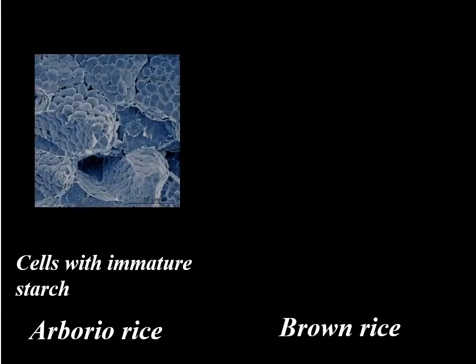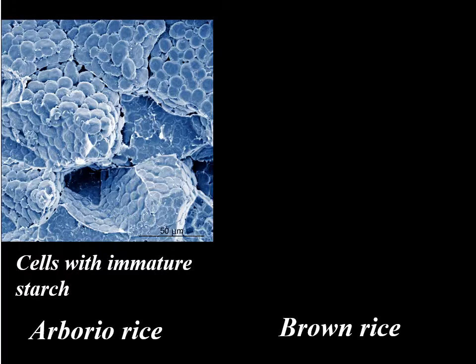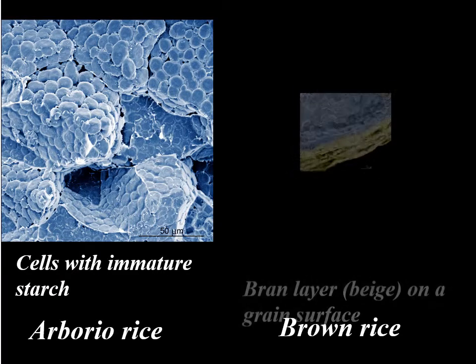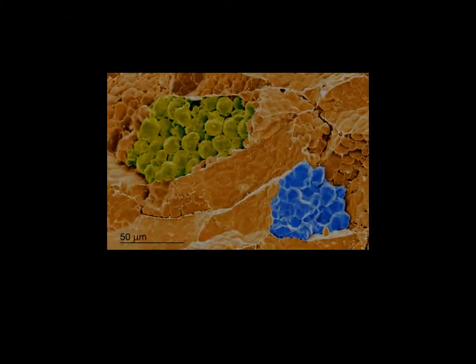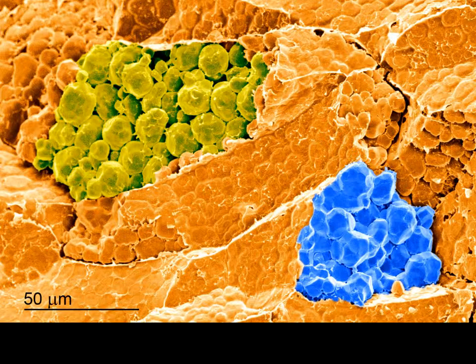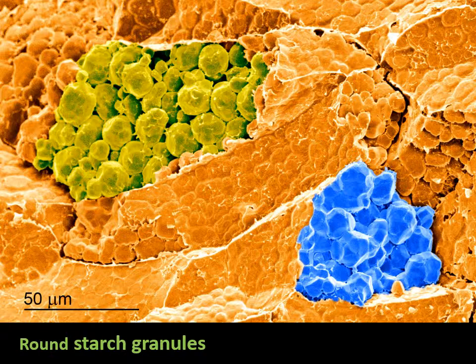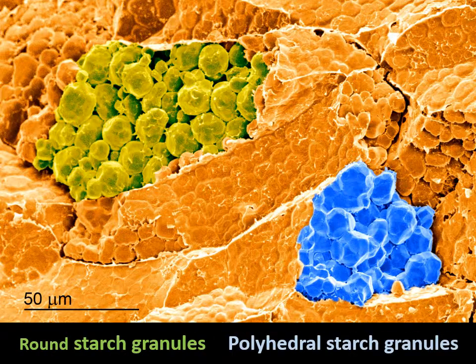A higher magnification and color enhancement reveal interesting features: round starch granules with void spaces around them in the Arborio rice grain at left, and a layer of bran on the surface of the brown rice grain. Two forms of starch granules are shown in this image in false colors: round granules at left, which give the grain a white chalky appearance as they reflect light, and polyhedral particles at right. When tightly packed, they look like perfect rice with a translucent appearance.